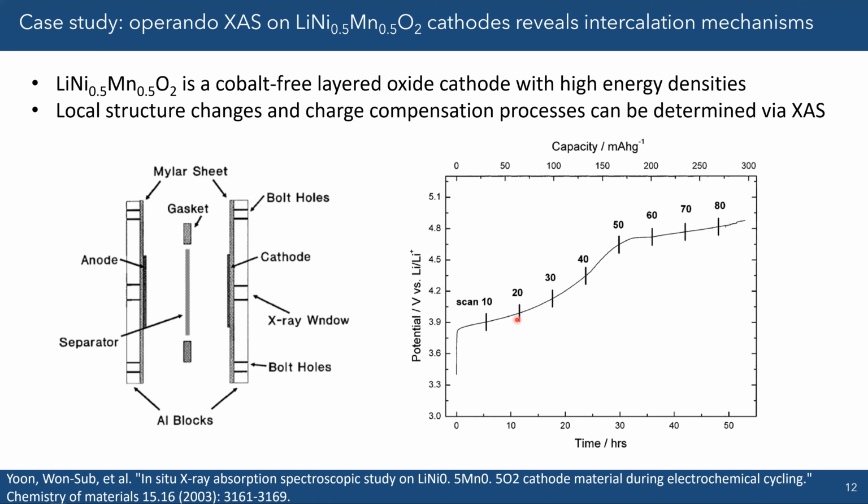Because if you hold it, then the structure might change, what the process going on in the material might change, so you're not actually getting the operando study. It's more of an in situ study rather than operando. So for operando, we are getting the average oxidation state at that range, right? Yeah. But these are pretty fast. So there is still structure change as you're doing the measurement, but on the time scale of the measurement, it's good. Okay. Thank you.